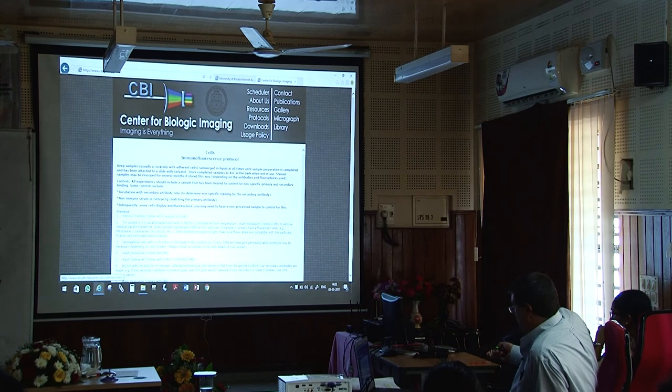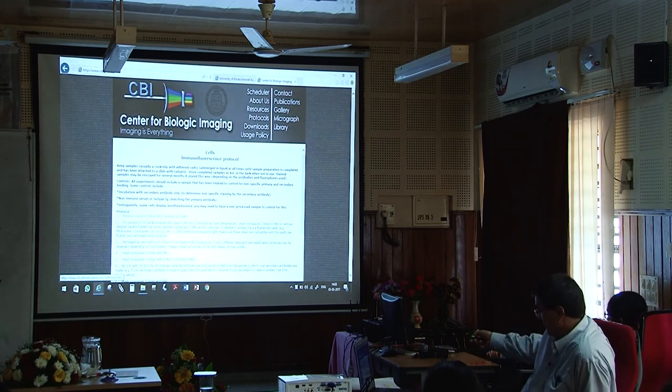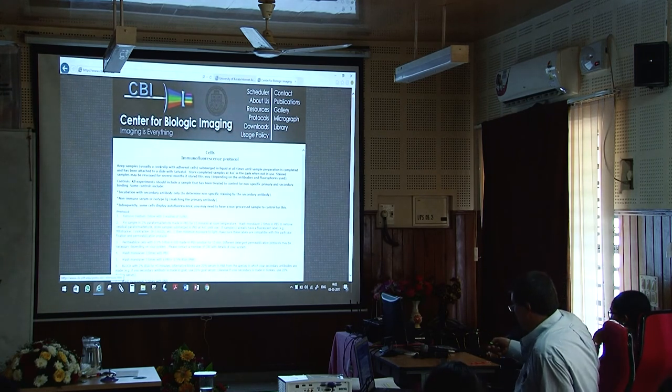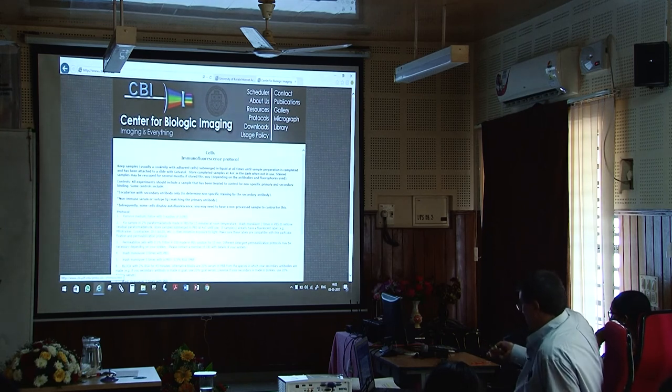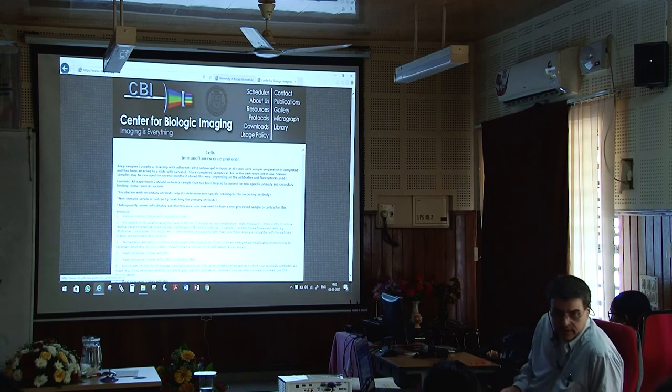If the sample already has a fluorescent label like MitoTracker or LysoTracker, then minimize the exposure to light. You don't have to worry about this unless you have one of these things like MitoTracker or LysoTracker or something like that. Just keep it out of the light because light will destroy these kinds of fluorescent trackers. And again, like I've said numerous times, check with the company before you do this, because if you use a dye and it says you can't fix with paraformaldehyde, and you fix with paraformaldehyde, you might just ruin the dye.